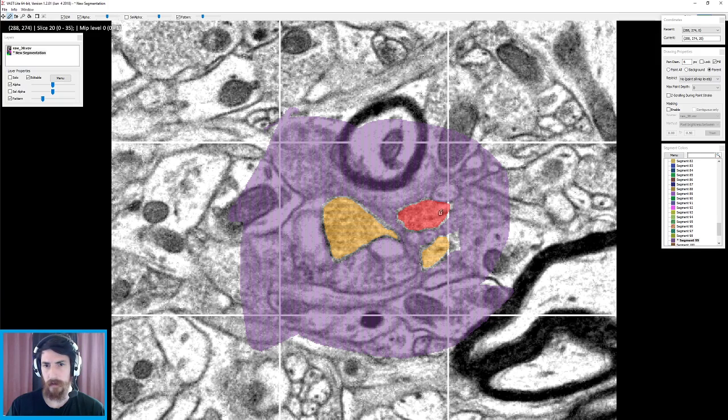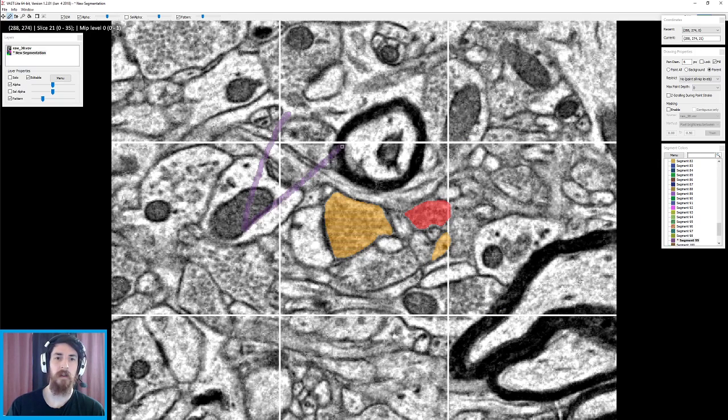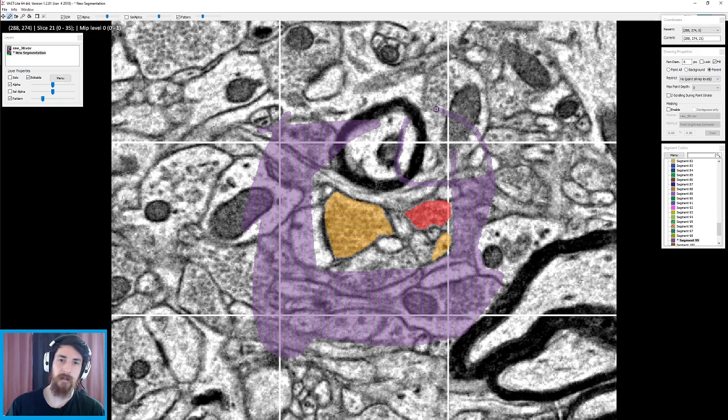Seems good. Seems legit. Let's peel this back. Alright. I think we're sitting at a few slices left. So let's get these last ones done, and we'll get this exported, and we'll move on to the next one. Okay. Let's make sure these aren't touching.